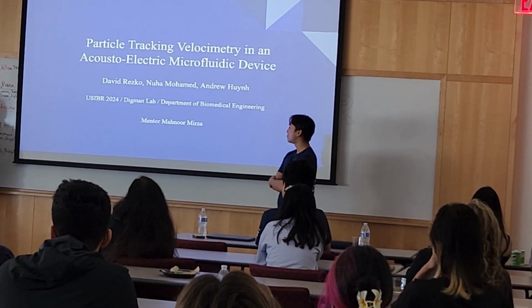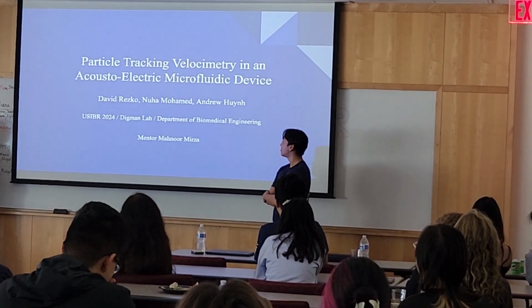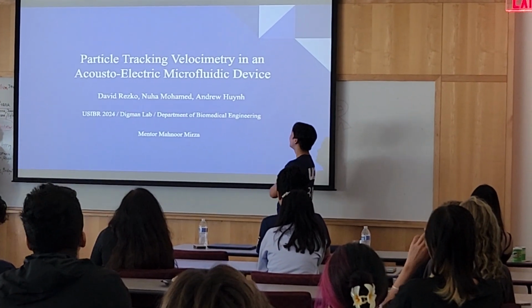And our project was on particle tracking velocimetry and an Acousto-Electric Microfluidic device.